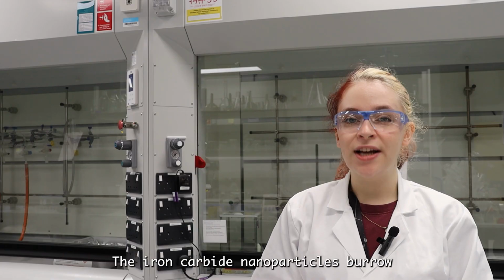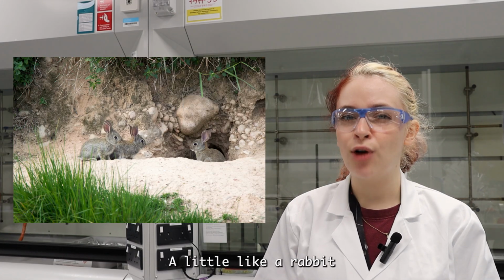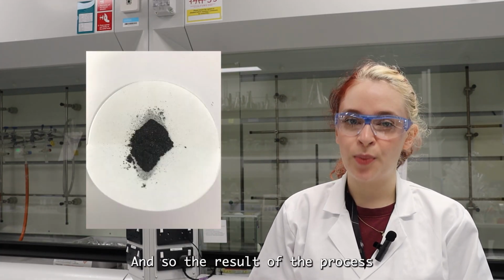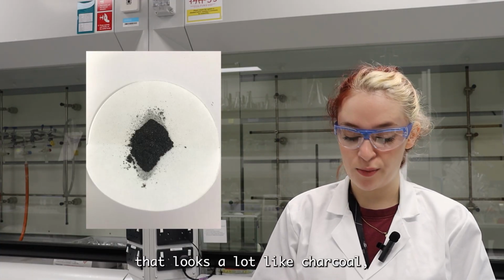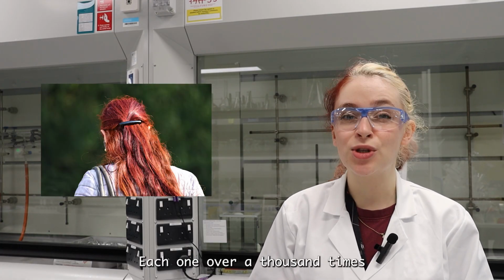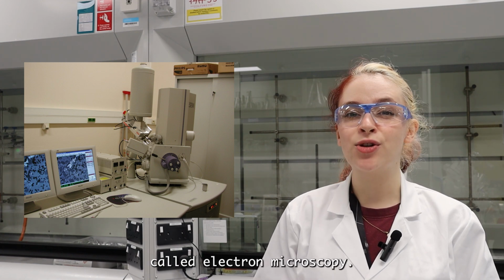The iron carbide nanoparticles burrow into the biomass, a little like a rabbit burrowing through the ground. What is left behind is essentially a carbon nanotube, and so the result of the process is a very solid material that looks a lot like charcoal, but is full of very thin, tiny hollow tubes, each one over 1,000 times smaller than a human hair. We can see these using a technique called electron microscopy.